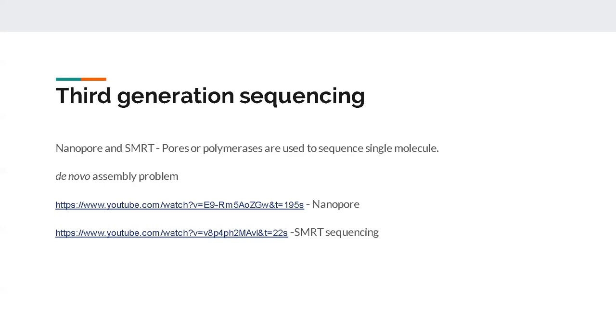Now, there are pros and cons to both of these, which we will discuss as and when we talk about other things related to NGS. These are the two videos that I found really nice. You can go back and look at these videos. They explain beautifully how nanopore and SMRT work.